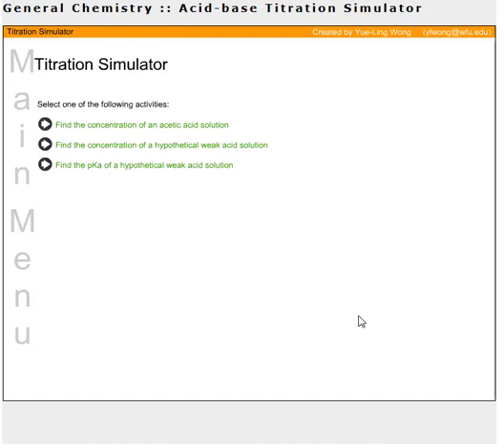So once you've clicked on the link for the titration, you're going to click on the top option here, find the concentration of an acetic acid solution.